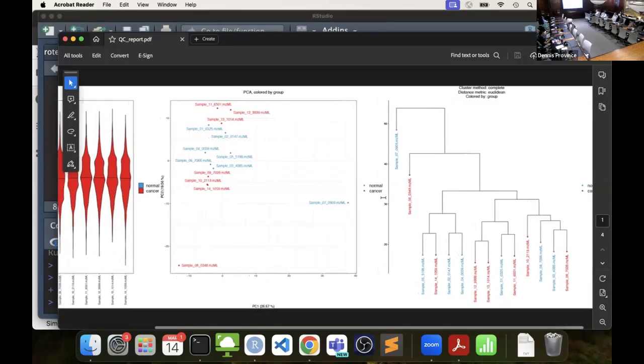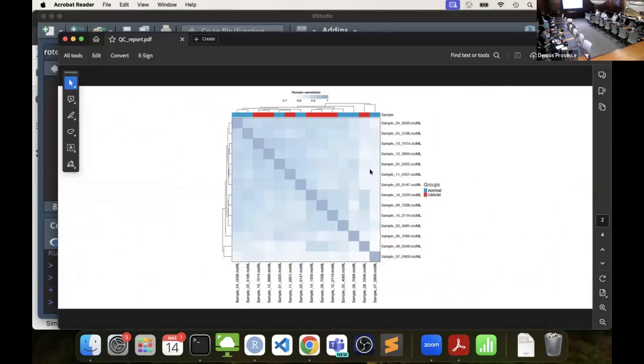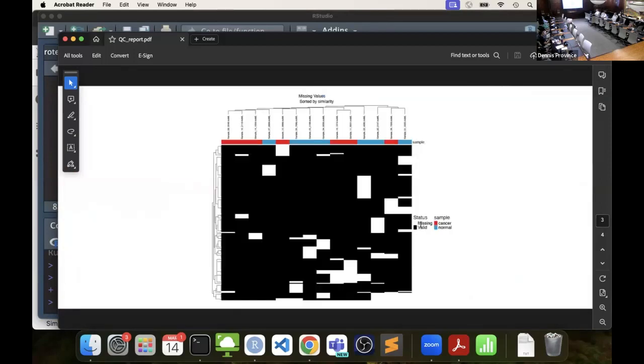So there's that. And then I've got the correlation again of replicates. I don't really use that one. But the missing value one is again helping us evaluate if we need to be more stringent with our filtering, less stringent with our filtering, those types of things. So you've got some control there. This plot is only showing the proteins that have a missing value. So this is not the entire proteome. If I do that, it tends to break. It can be at 8,000 or whatever, but yeah.